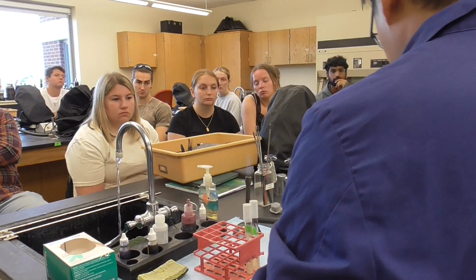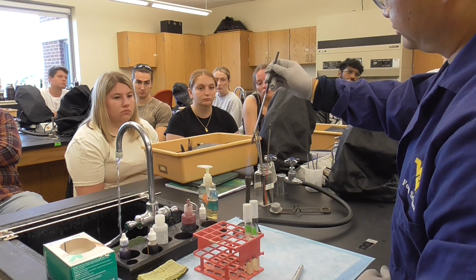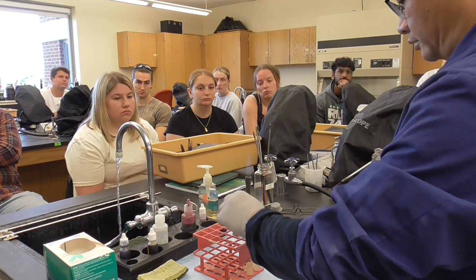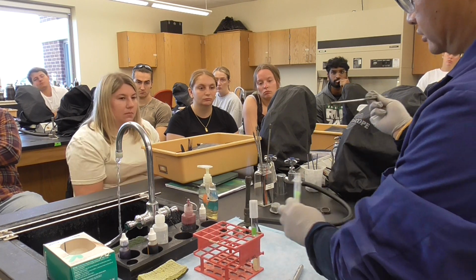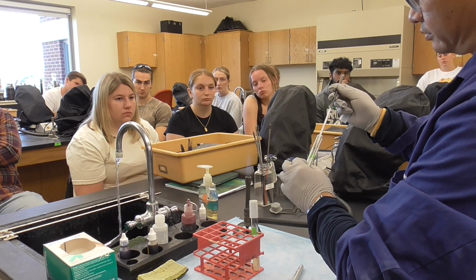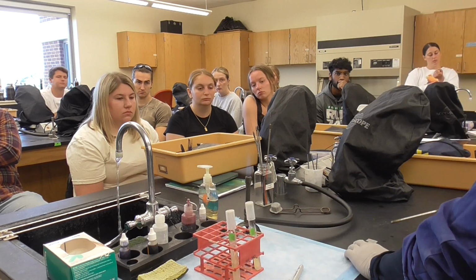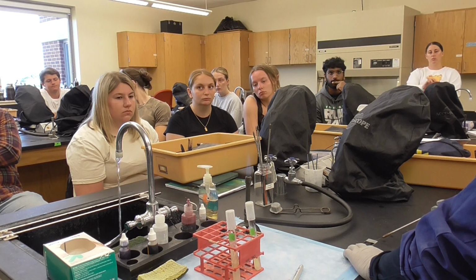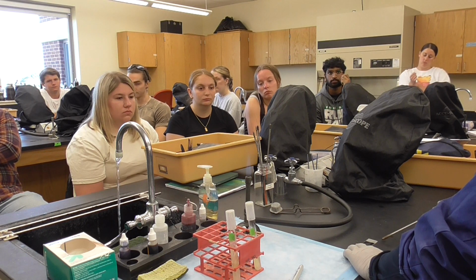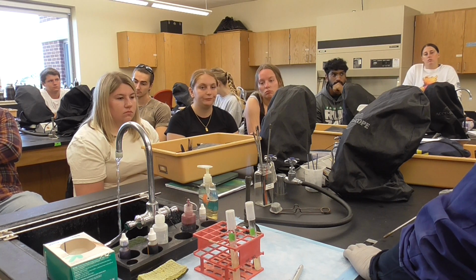Okay, now we're going to get some water. One drop. Another water. Two drops. Okay. Now we flame it again. Now we're going to put the bacteria. Let's put the E. coli first. So little finger, go down. You pick the bacteria right there. I'll pick a little bit more. Okay. And then make a big smear, same thing like you did before. Make a big smear.